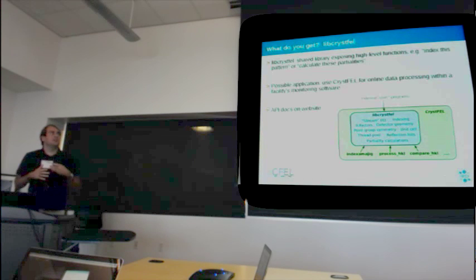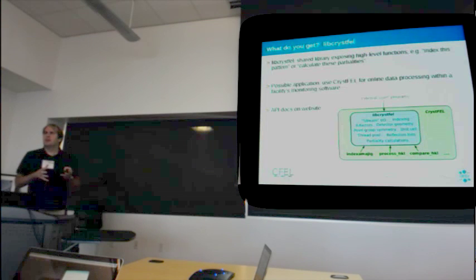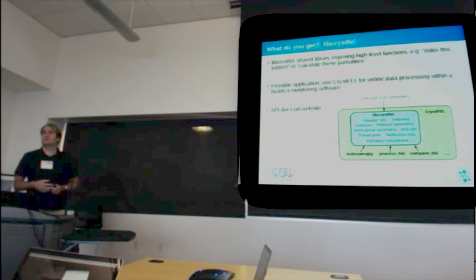What it's meant to be is best illustrated by this possible application: if you wanted to use CrystFEL for an online data processing workflow, for example in an online facility processing setup, you could write a plugin to the facility's data processing framework that calls these CrystFEL routines. That would save going to pull out and run the program.